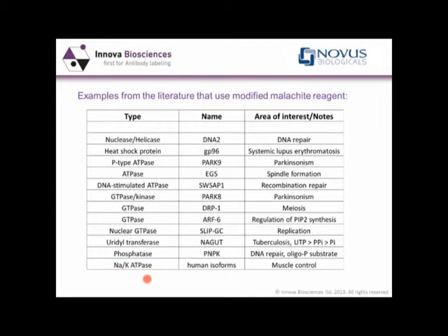So by focusing on a universal product of phosphate-generating enzymes, you can assay a very large range of enzymes, and you've just done the assay development once.